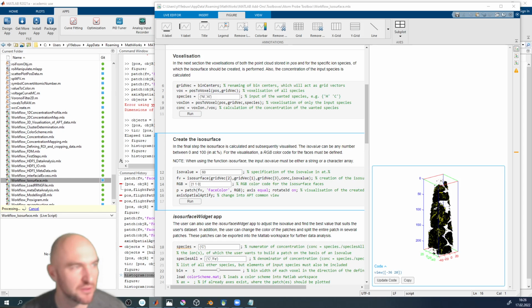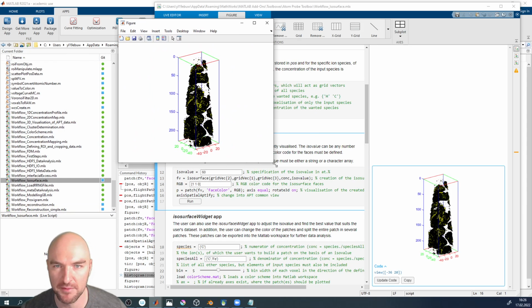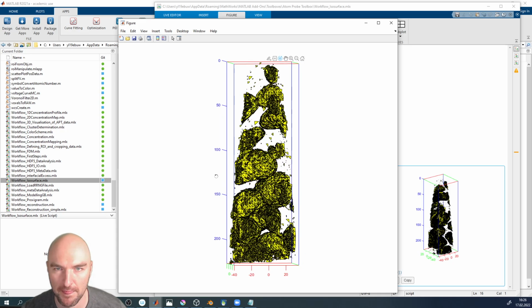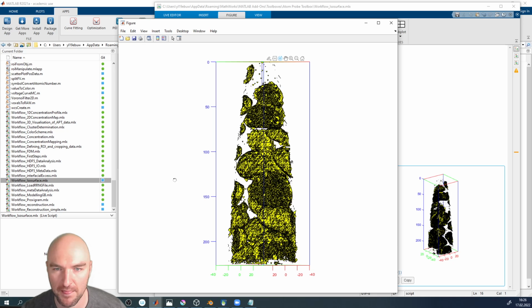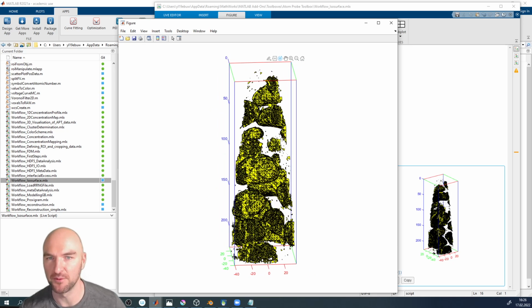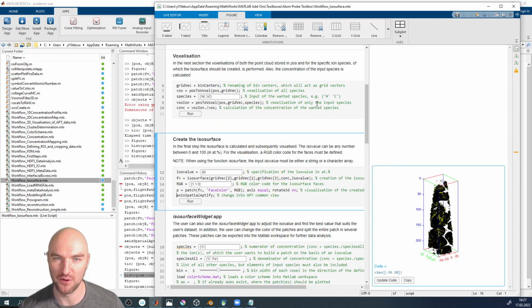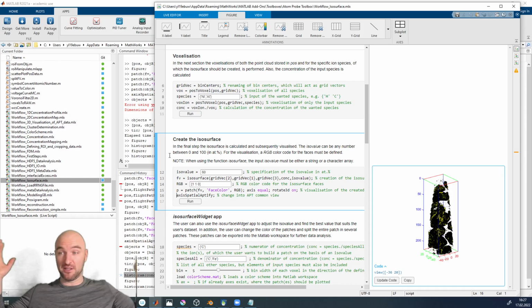Now I hope all of those surfaces come out a little bit cleaner than before. Well, a little bit, but anyway, we're going to talk more about isosurfaces tomorrow. The important bit is now we have those isosurfaces and we can use them for reconstruction calibration. So the question you might ask is, why don't I just look at the atoms themselves and use that?